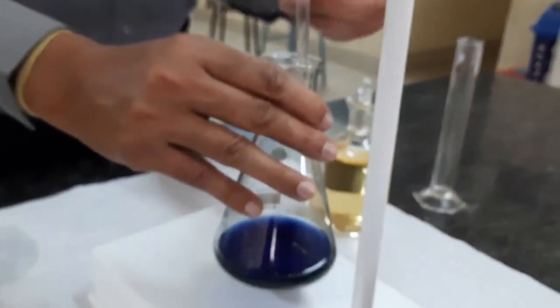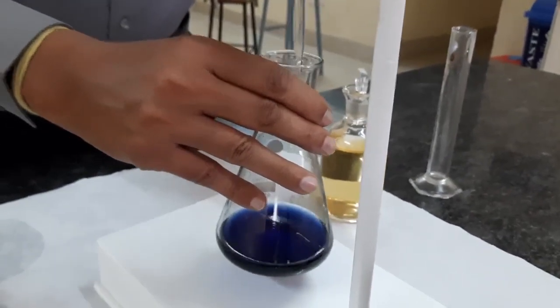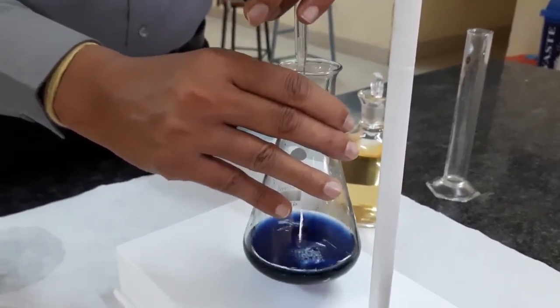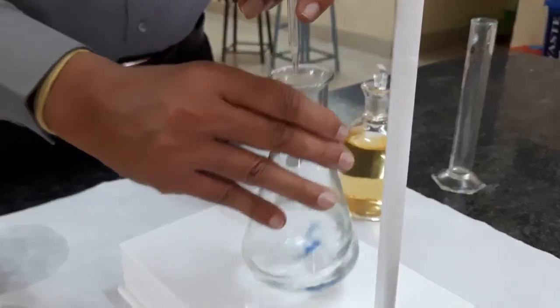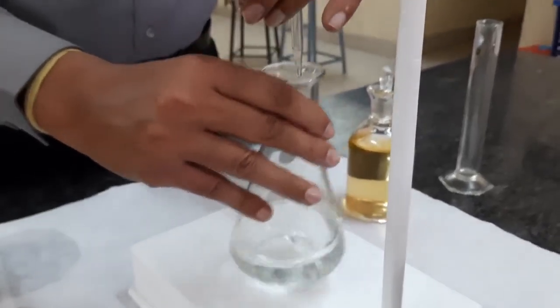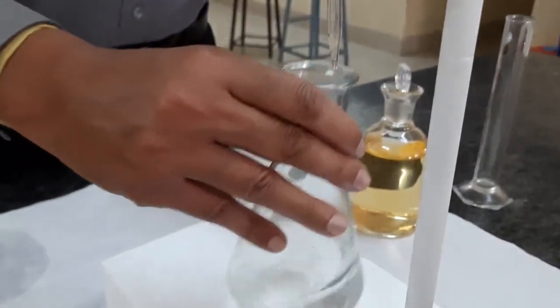Once again, ensure that the initial burette reading is 0. You have to add the titrant slowly, dropwise, and see that it has become colorless.